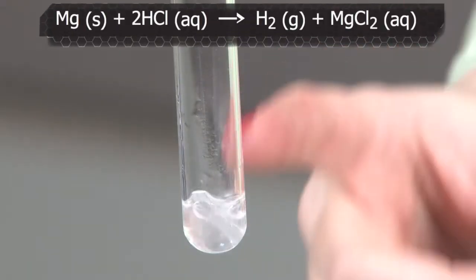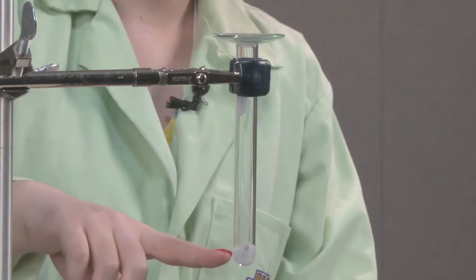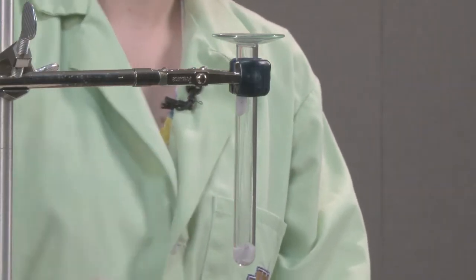As you can see, the magnesium metal is reacting with the hydrochloric acid to produce hydrogen gas and aqueous magnesium chloride. The bubbles that we see are evidence that the hydrogen gas is being produced.